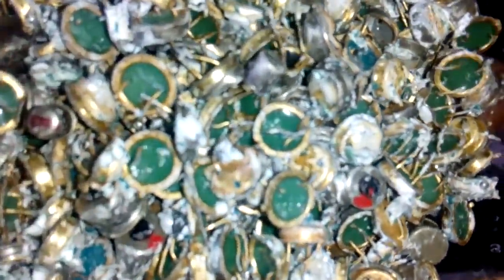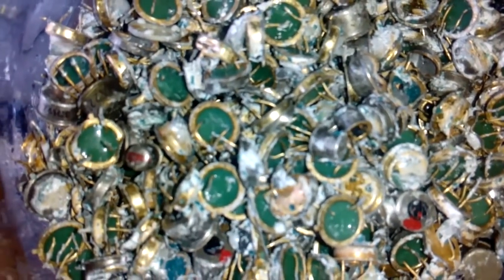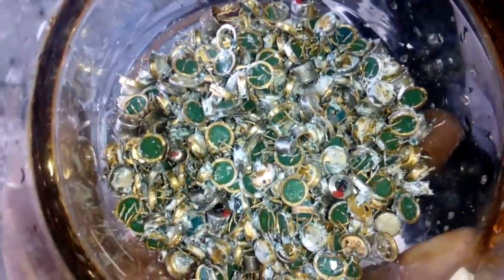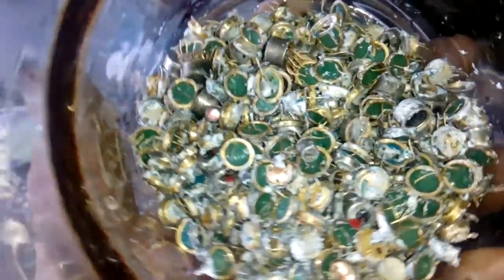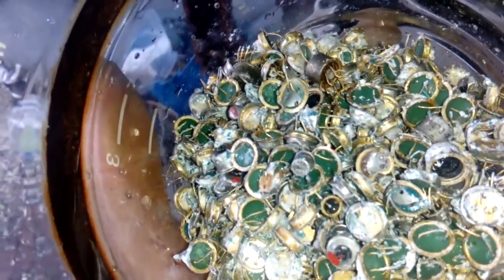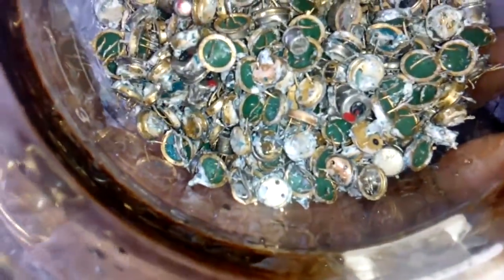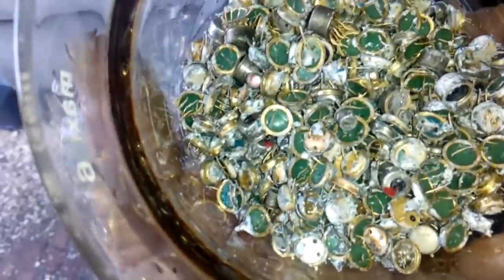But before we process this, today we first remove that white pasta — I don't know what it is, but it looks like some pasta. So I will boil that in hot HCl to remove that pasta and maybe some tin. Then we go to Aqua Regia.